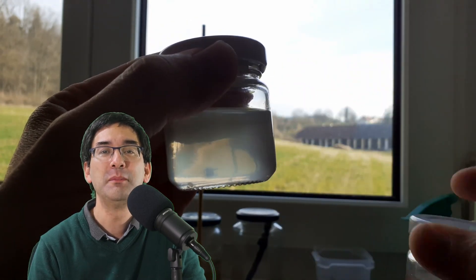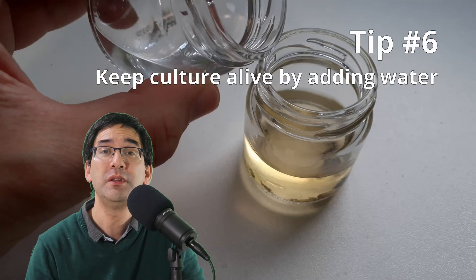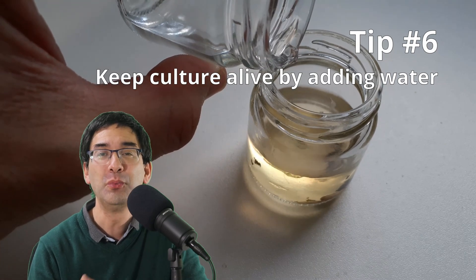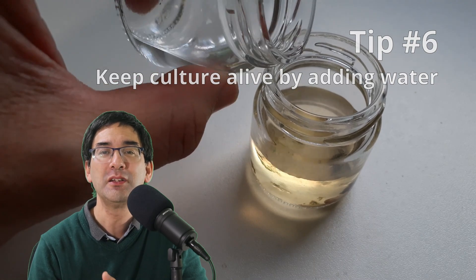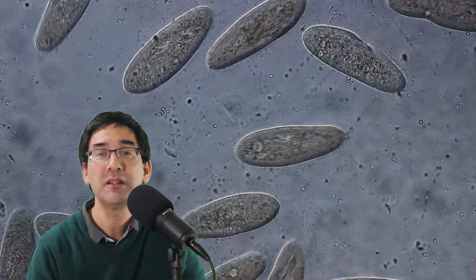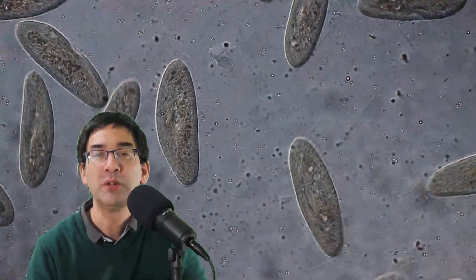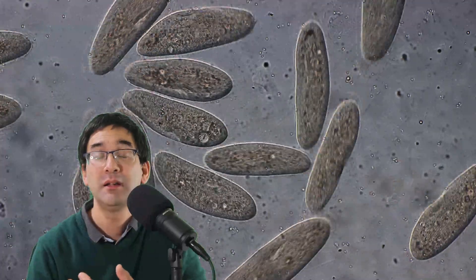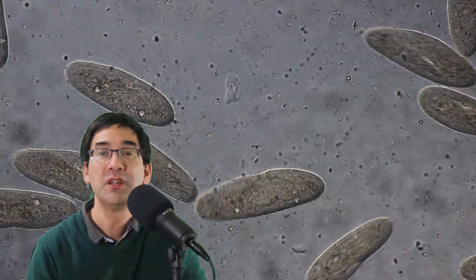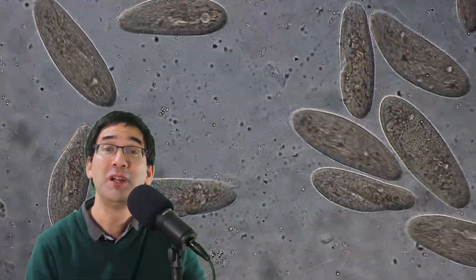Tip number six: over time the water evaporates, so when replenishing do not use chlorinated water. Ideally use pond water from the same place where you collected the original sample, but you can use tap water — just let it stand for a few days to allow the chlorine to escape. If dechlorinated water is not available, you can also use bottled water, which works as well.